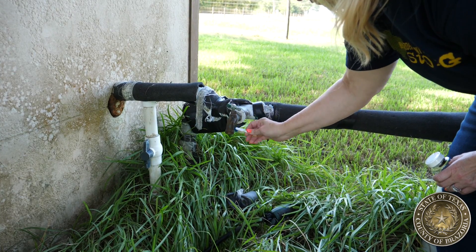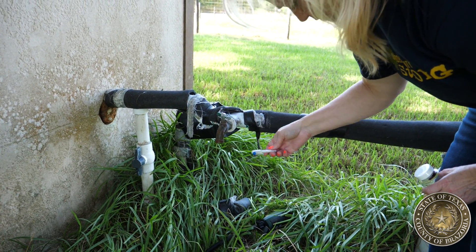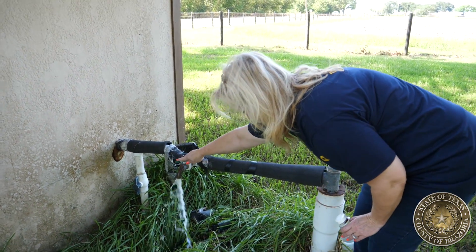When you have cleaned the outside and the inside of the spigot, you'll turn the water on full blast and allow it to run for three minutes.